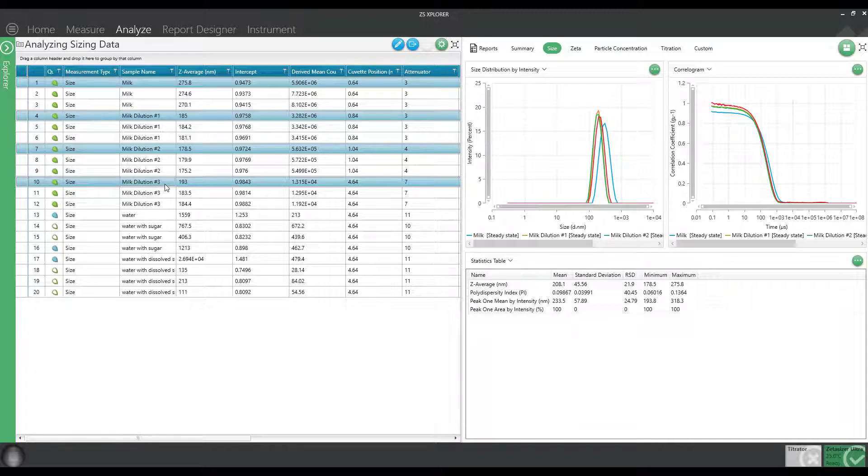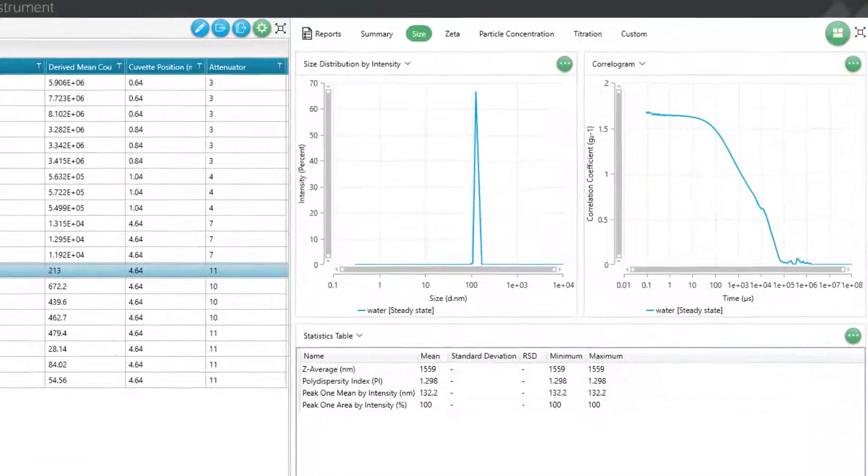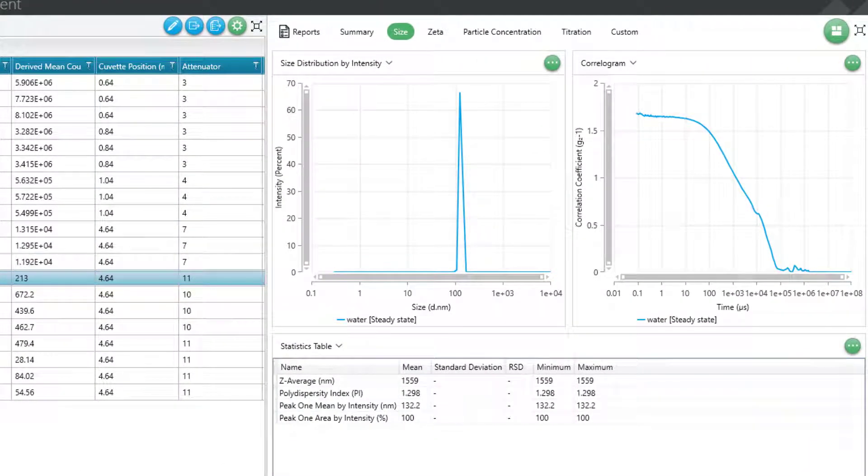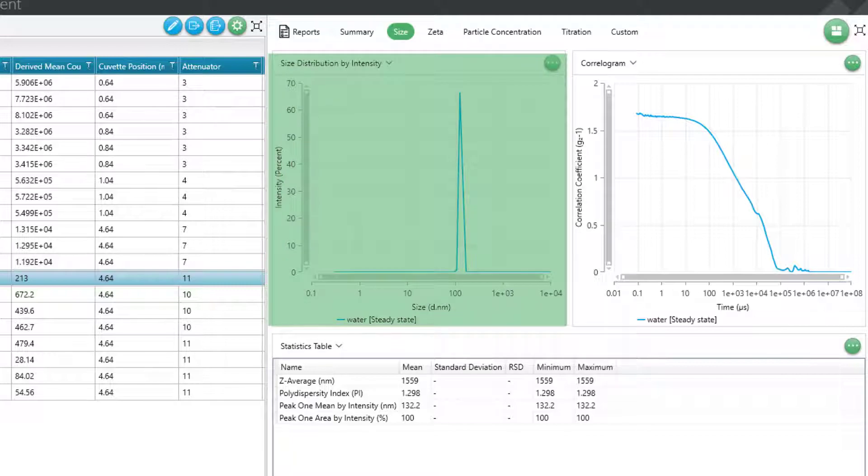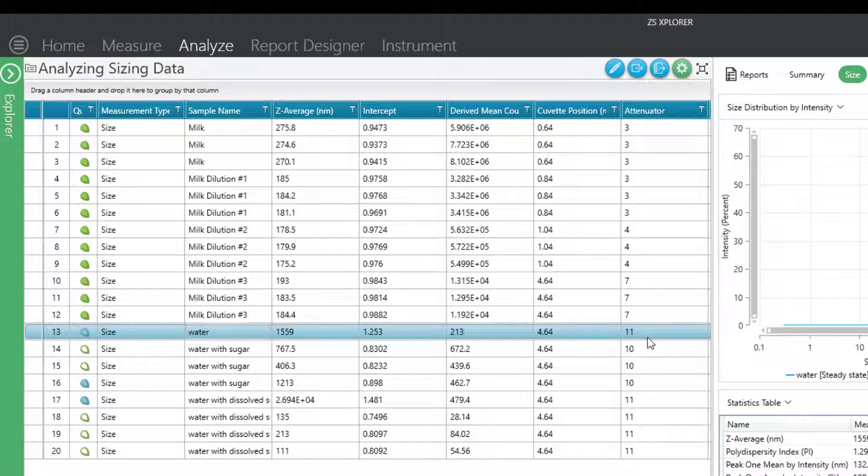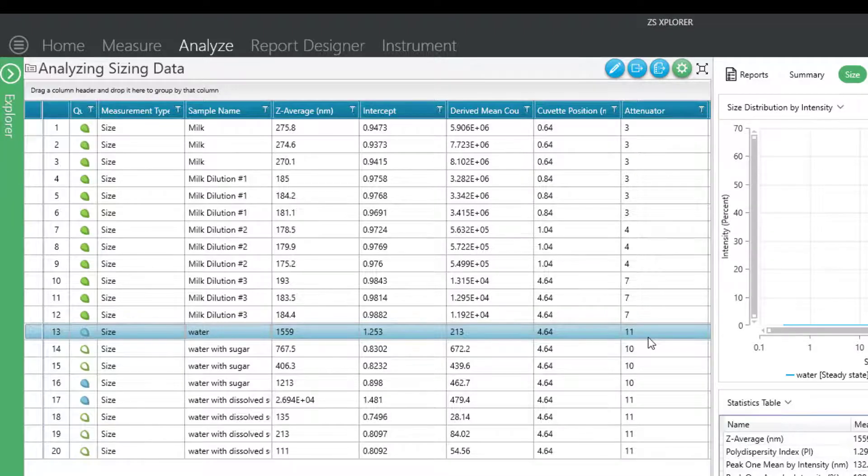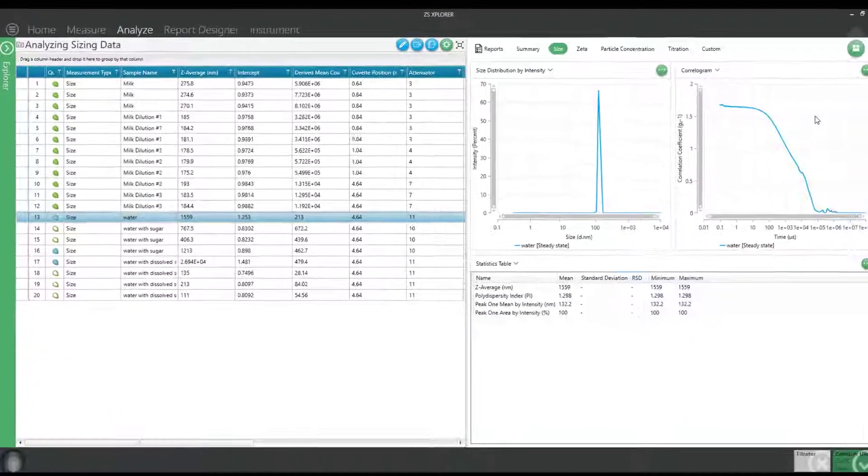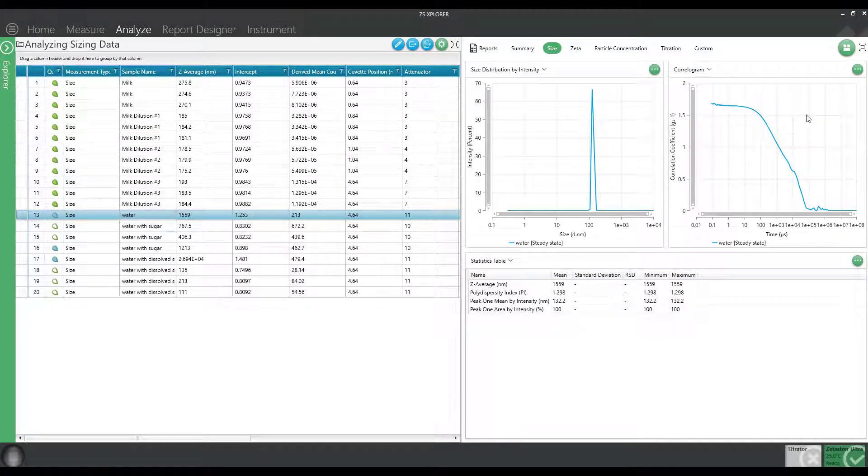Now let's talk about something that's too dilute. So I just wanted to show an example of what it looks like if I just put a sample that doesn't really have any particles in it. In this case, I just took water and measured it. I get a result, but is the result really meaningful? Now, if I look over to the attenuator and I look over to the derived count rate here, we can see the derived count rate is very low. We can also see the attenuator is 11, which means I'm using full laser power and I still don't get very much scattering from this sample. So it is very, very dilute. So in this case, probably what I'm measuring is a little bit of dust in the water of my sample.